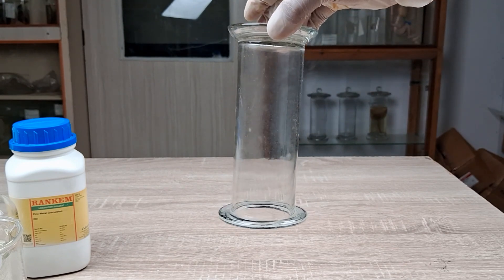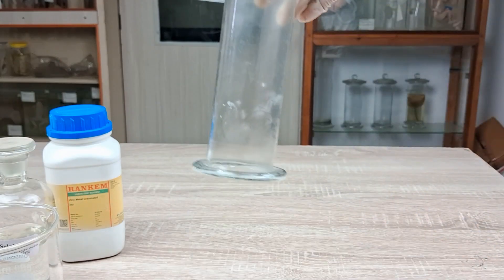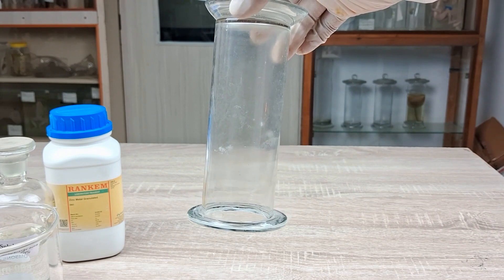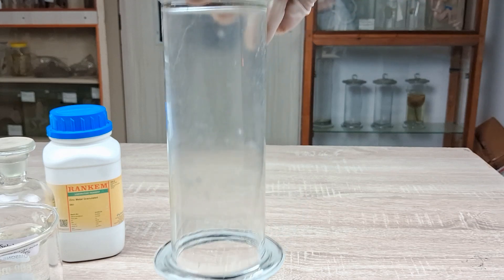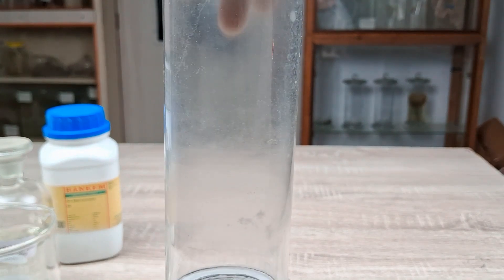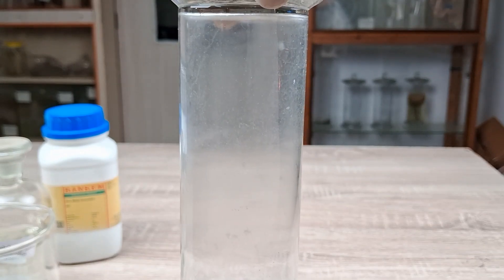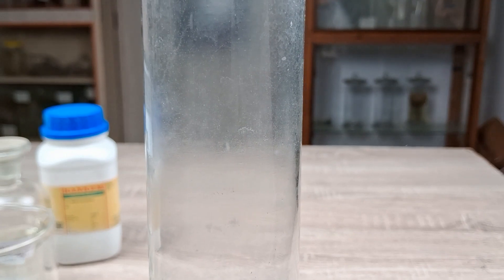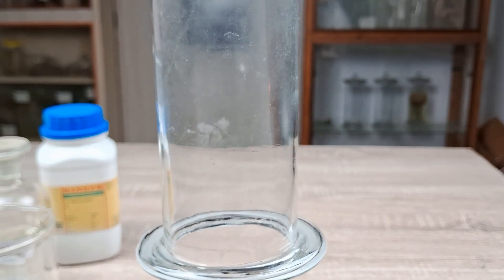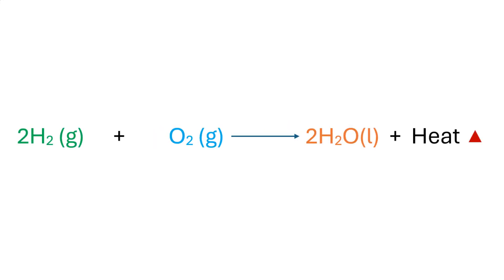When a burning splinter is introduced near the mouth of the gas jar filled with hydrogen gas, the gas immediately ignites explosively with a characteristic pop sound. Once the gas inside the jar had completely burned, you can see a hazy layer of condensation forming on the inner walls of the jar. Hydrogen gas reacts with oxygen present in atmospheric air to produce water. Just as in the burning of magnesium ribbon, this reaction also requires an external energy input in the form of heat — in this case the burning splinter — for the reaction to commence. The condensate on the inner walls is tiny droplets of water formed as a result of the combination reaction between the two gases, making this another example of a combination reaction because a single product, water, is formed.